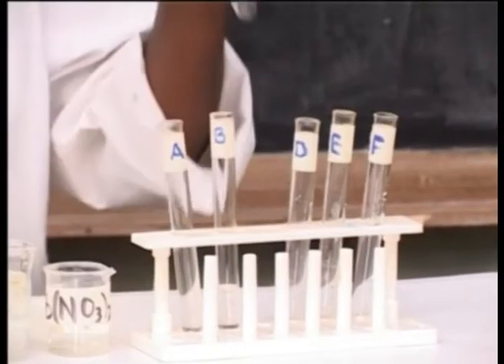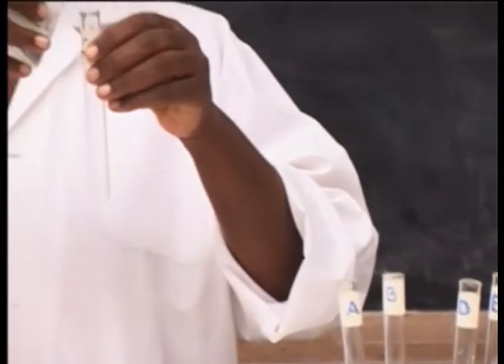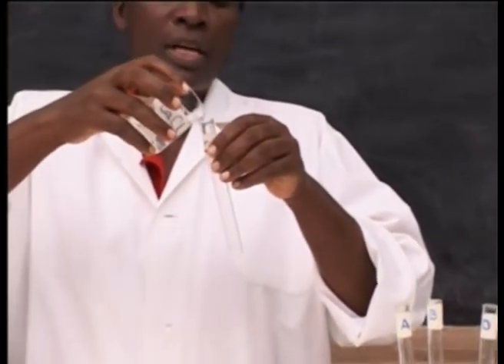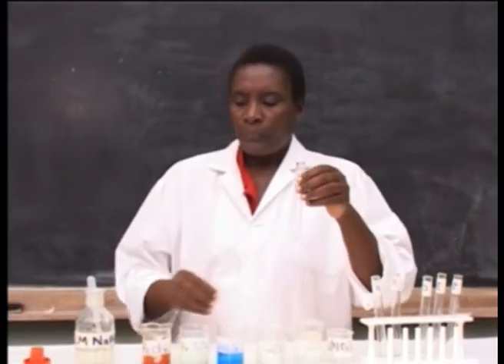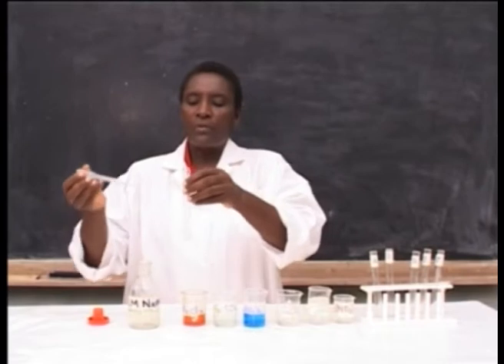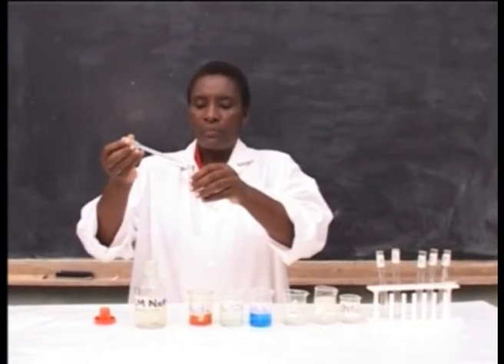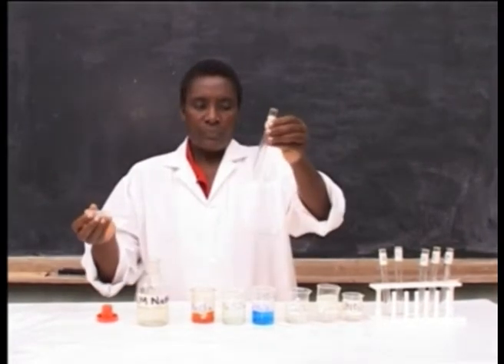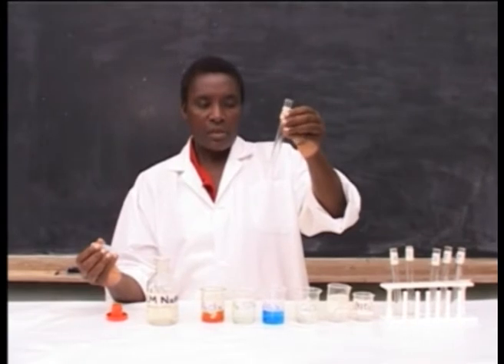Take test tube C, put salt solution calcium chloride, then add few drops of sodium hydroxide solution, and observe the changes.